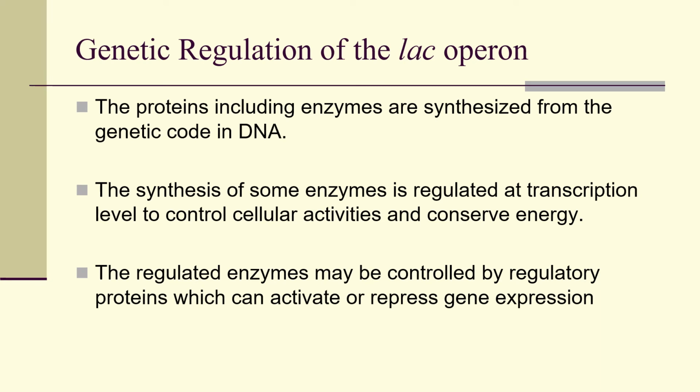Now let's move on to the second part of today's lab. The experiment is genetic regulation of the lac operon. Today we will do the first session. There will be a lab report that you need to submit for this experiment.